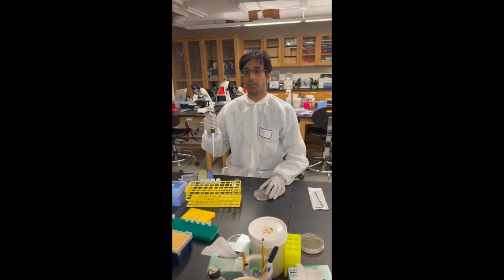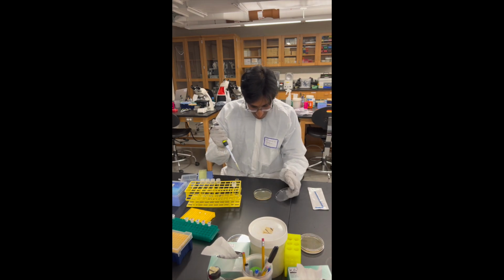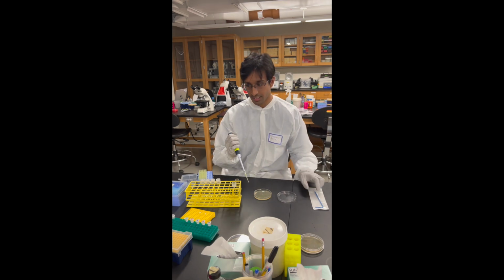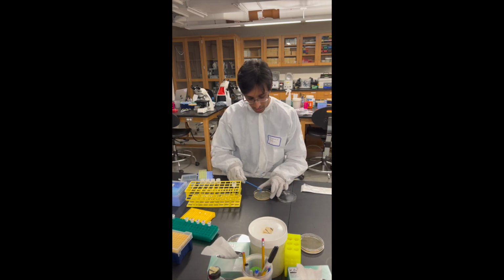We then spread some of our diluted solution onto the plate. After the dilution, we should have roughly 1,000 cells on our plate, which contains a medium to support yeast growth.